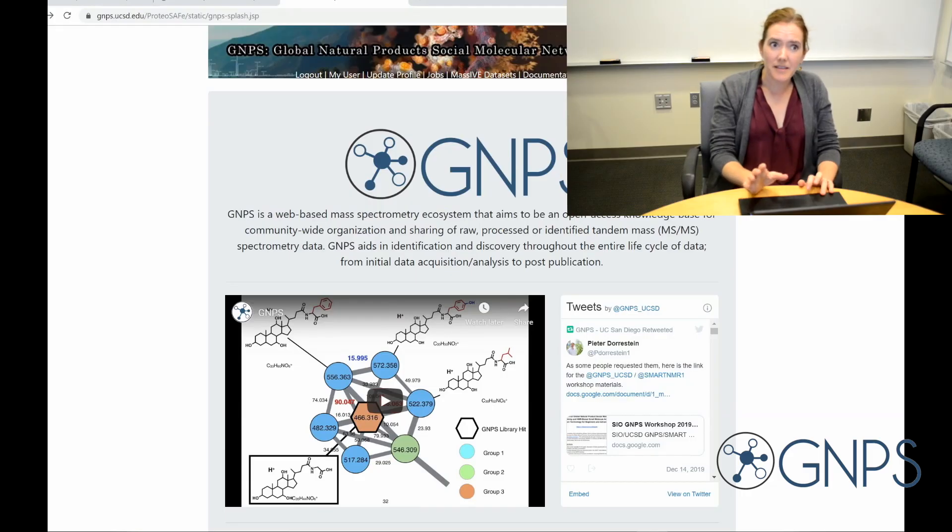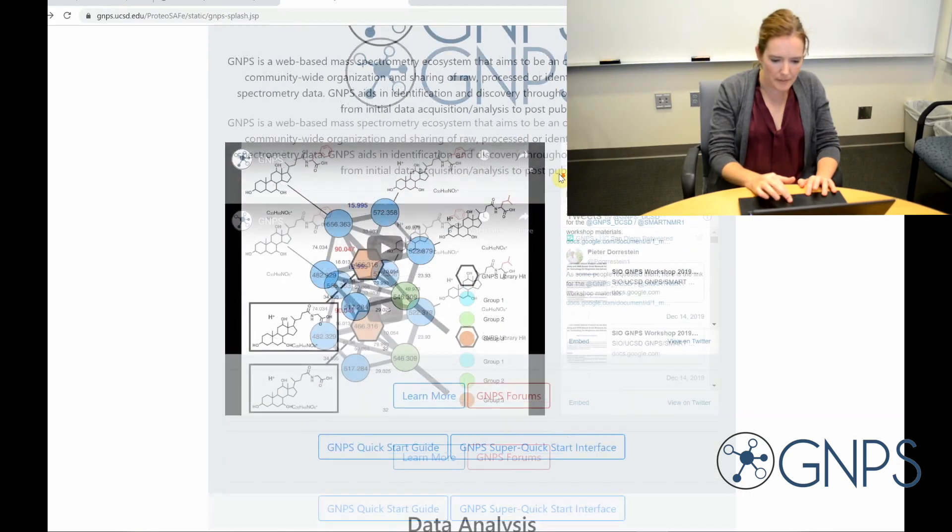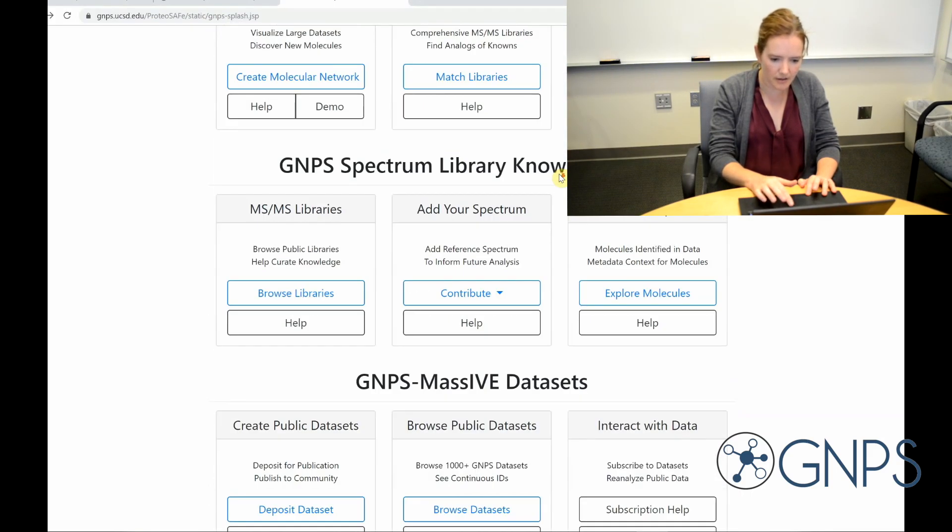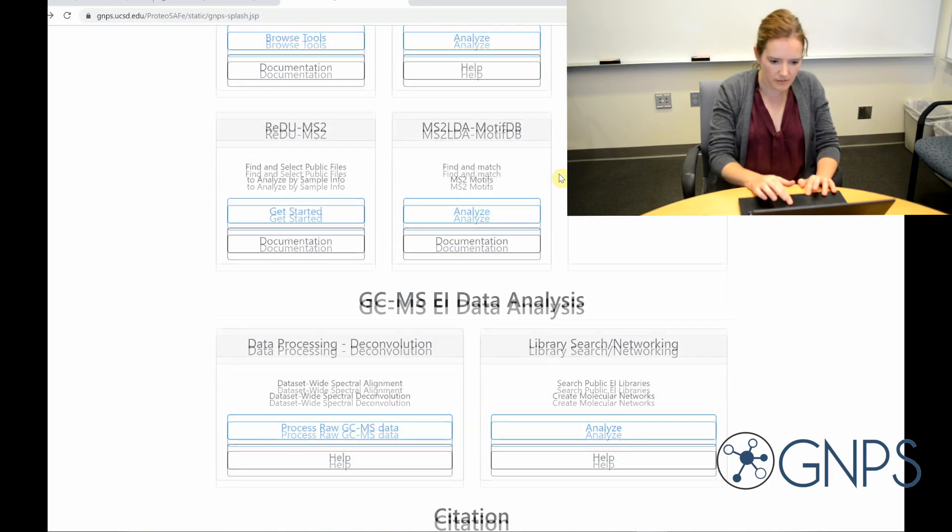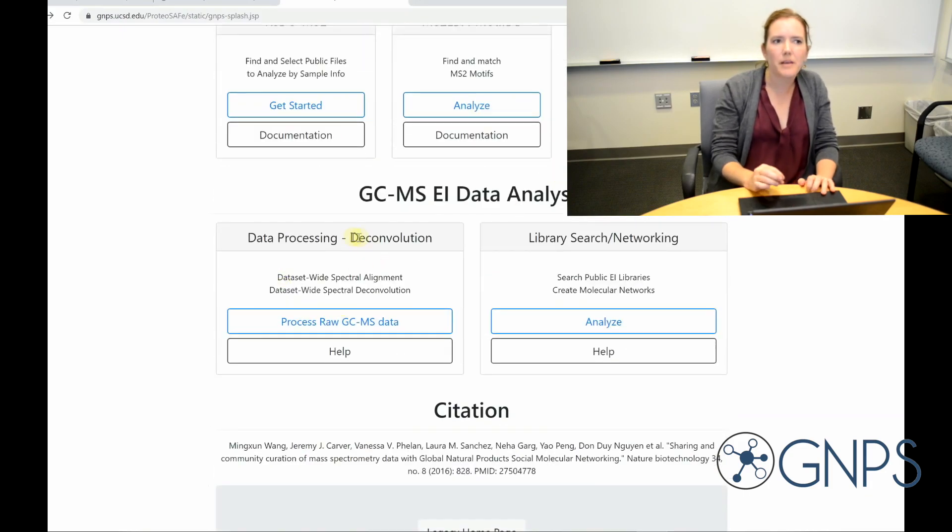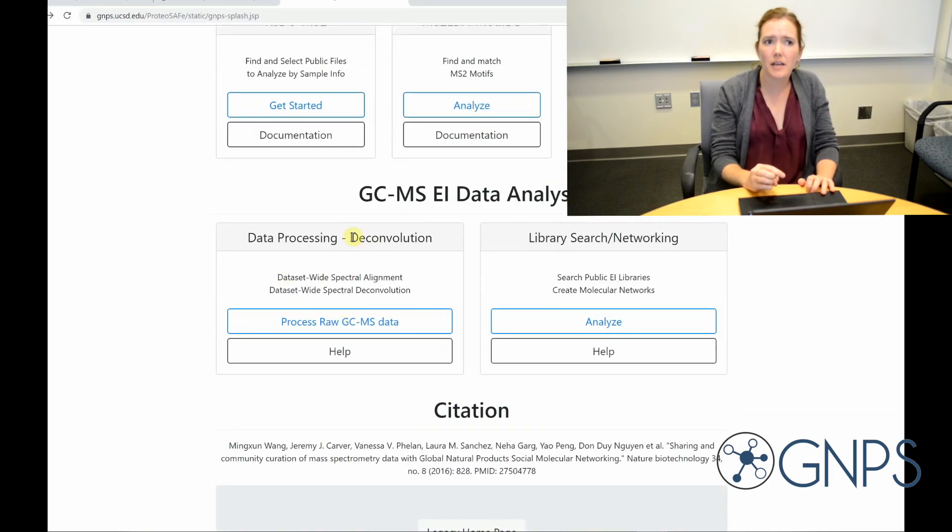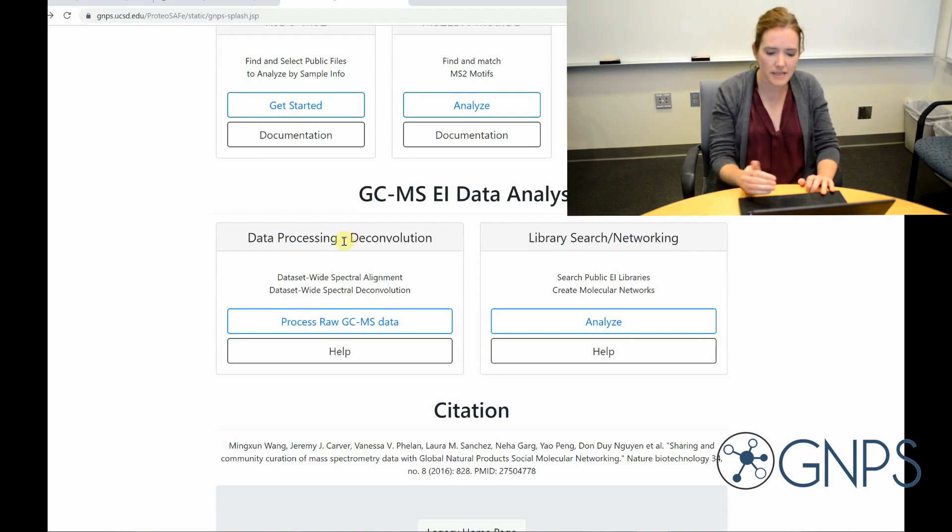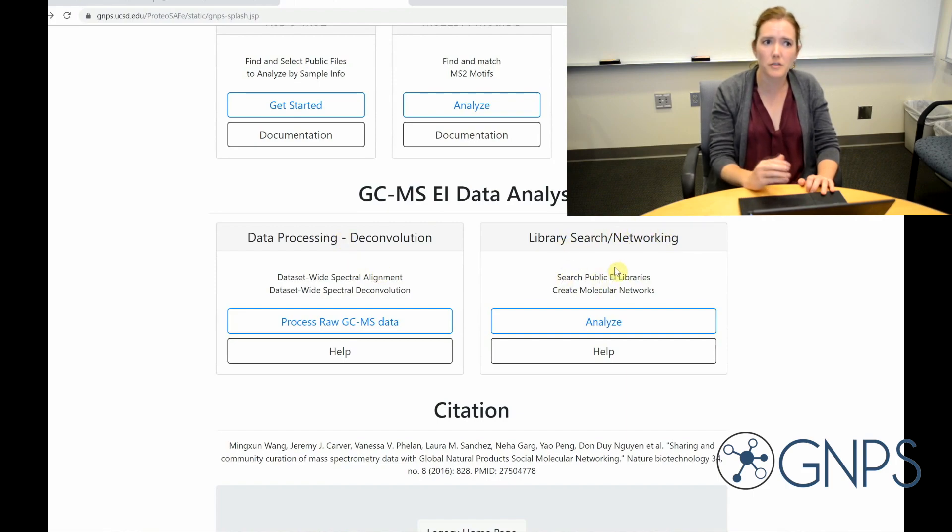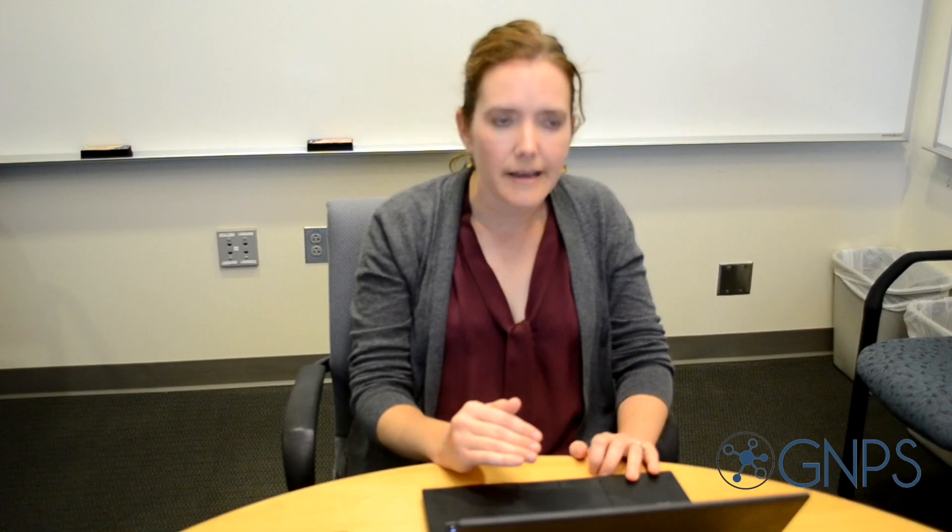So GC-MS analysis has two steps. You can see here the first step is deconvolution, which takes the experimental data and generates spectral patterns that correspond to individual compounds, and then step two is the library search with molecular networking, which we're going to use to identify compounds that correspond to those spectra.